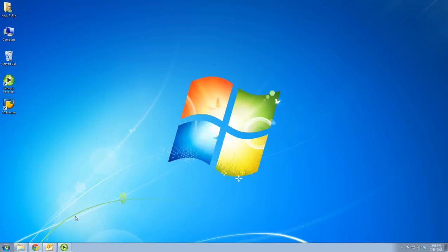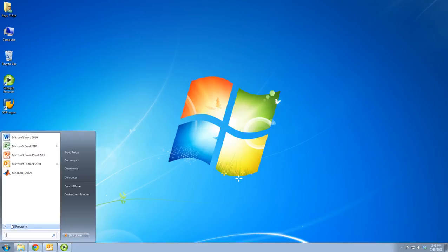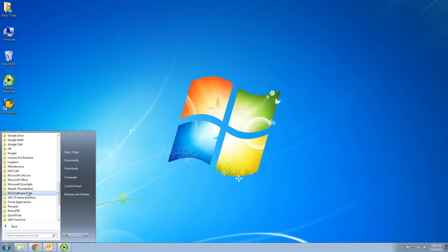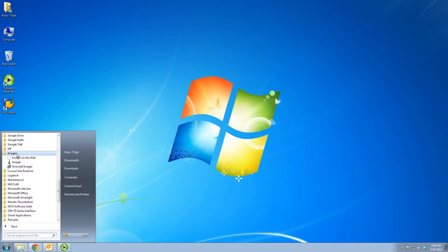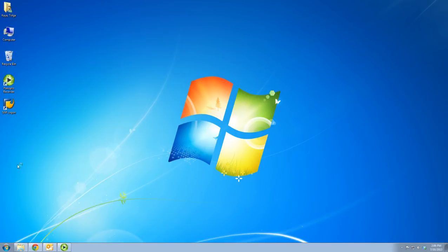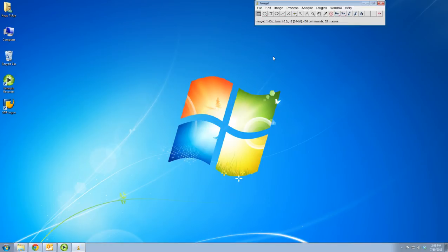I'll show you how to import images into ImageJ and do some image processing with those. I'm going to open ImageJ — you have it on the computer in 127. Here is ImageJ. It's a very simple software.